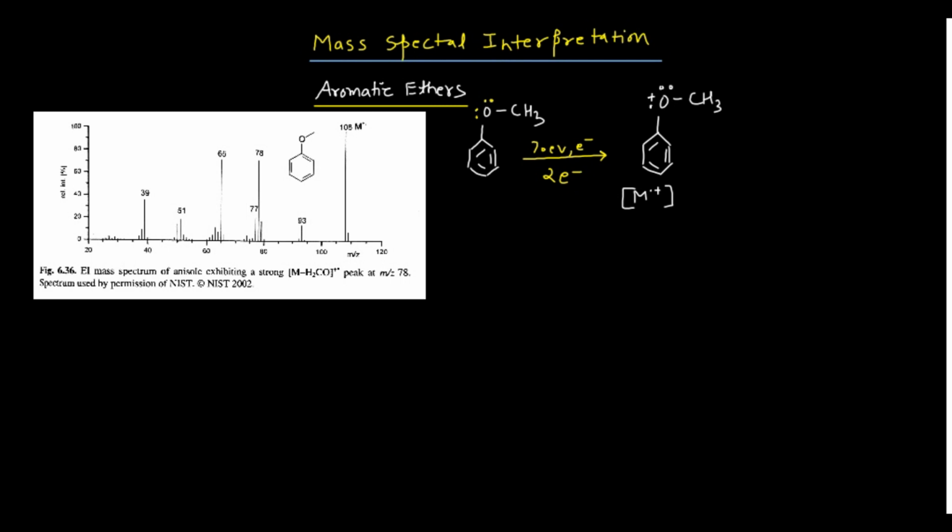If you count the molecular weight of the compound, 7 carbons are there, 1 methyl and 6 of the benzene. So 12 times 7 is 84, and 16 for the oxygen, 84 plus 16 gives 100. And then 3 hydrogens on the methyl, and the remaining hydrogens on the ring, 4, 5, 6, 7, 8. In total it makes 108.